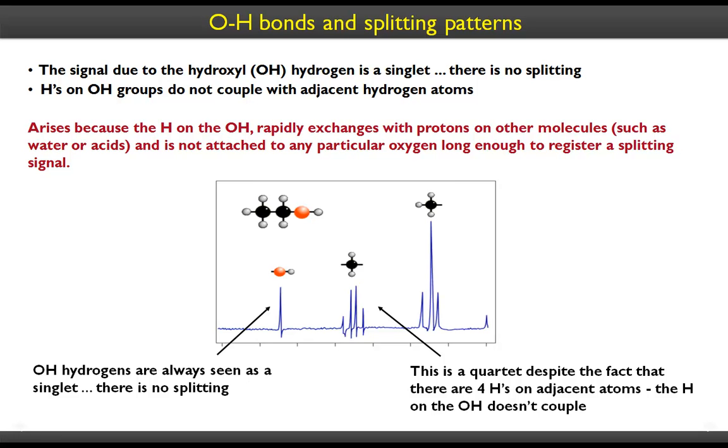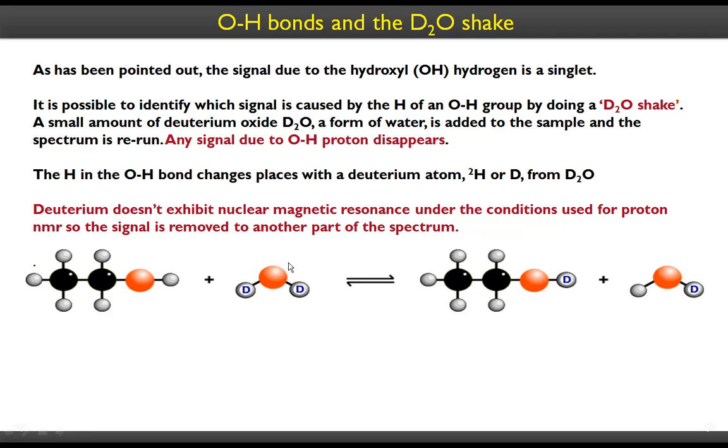As a result, you would not only see the differences in the splitting patterns, but also you see the difference in the chemical shifts depending upon the extent of the hydrogen bonding. For example, we'll see that in a minute.